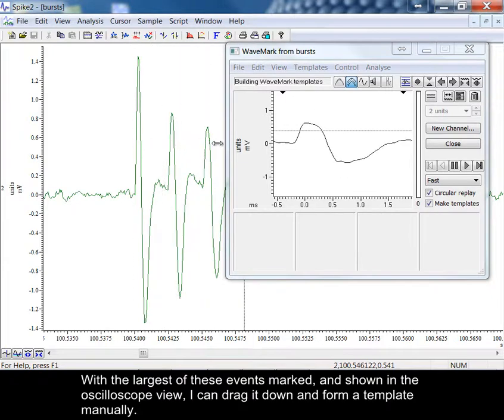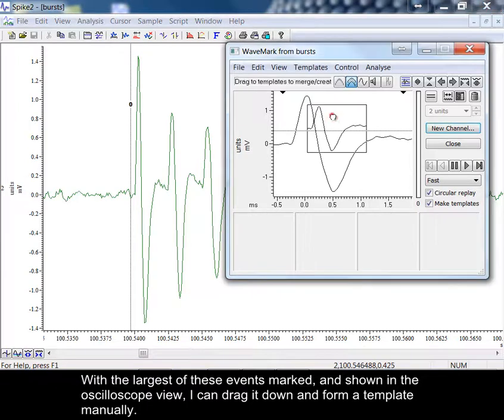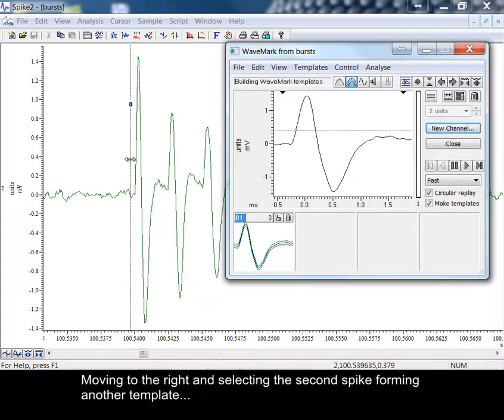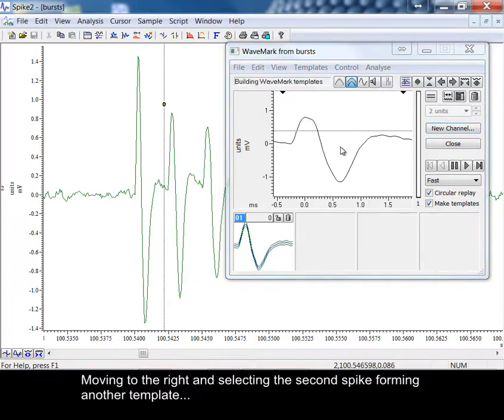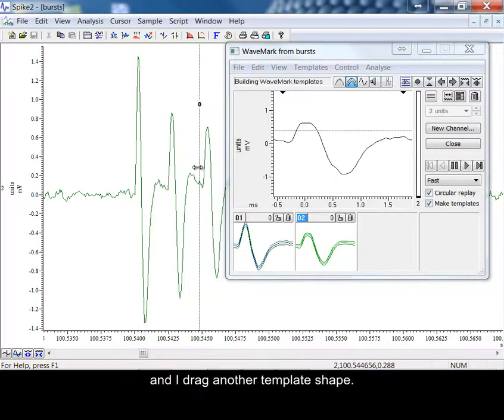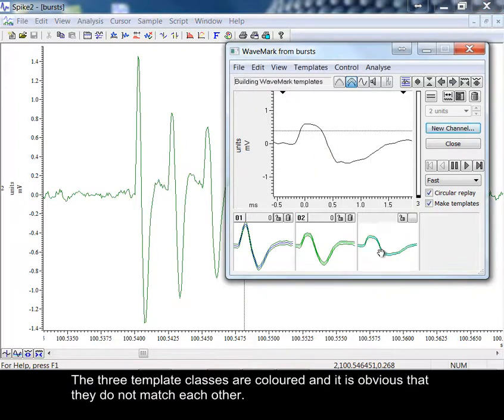With the largest of these events marked and shown in the oscilloscope view, I can drag it down to form a template manually. Moving to the right and selecting the second spike forming another template. To the last event, I drag another template shape. The three template classes are colored and it is obvious that they do not match each other.